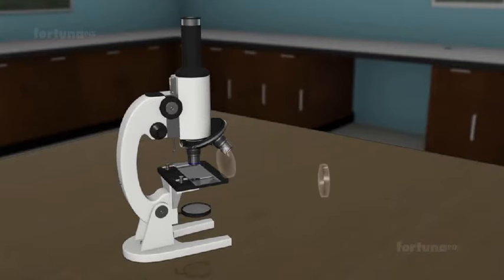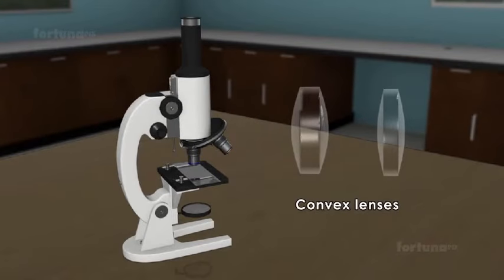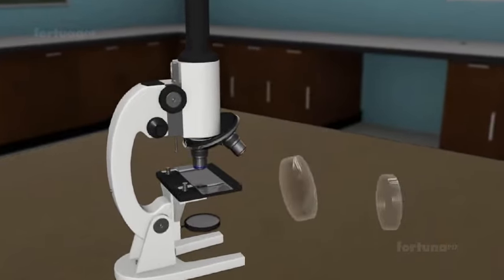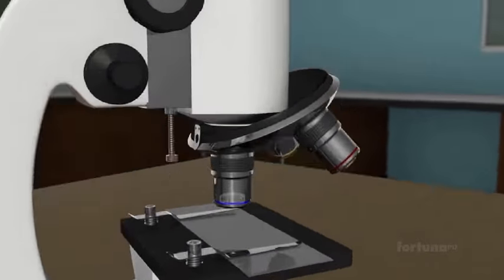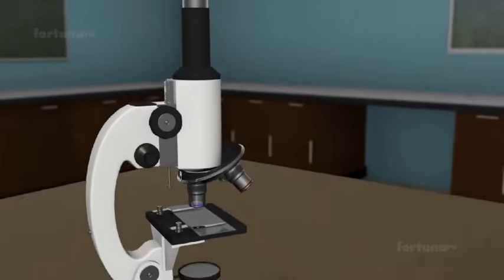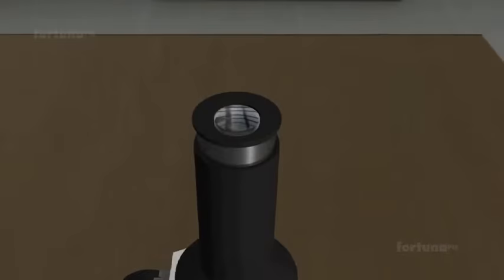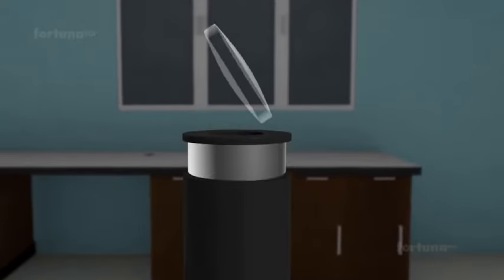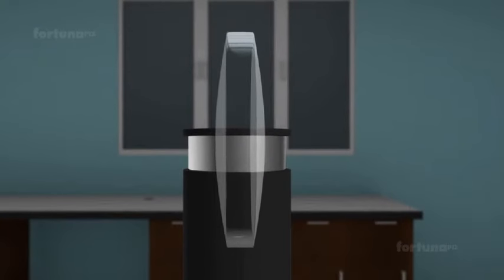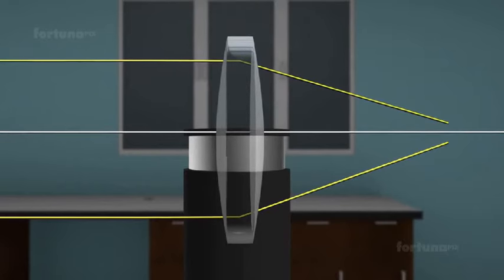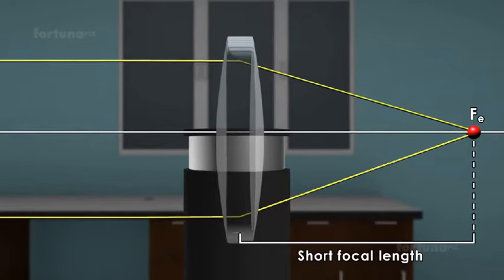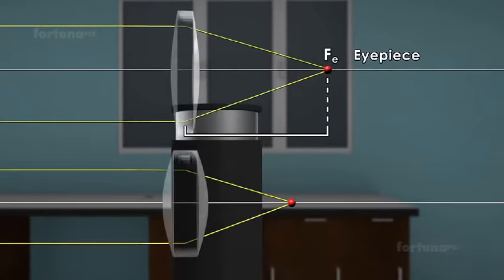The lenses are convex with different focal lengths. The lens closer to the object is the objective and has a short focal length F0, usually below 1 cm. The lens nearer the eye is the eyepiece. Although the eyepiece also has a short focal length Fe, it is still greater than the focal length of the objective.